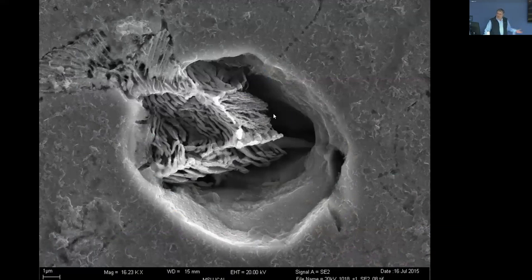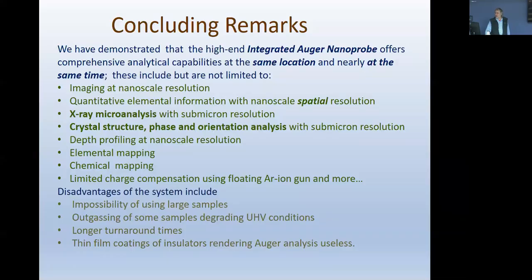The system predicts that these cementite features, these carbides, corrode first, and they open up a hole, and underneath appears to be a manganese sulfide inclusion. If you look carefully, it's a tunnel being dug underneath. So that's what happens. Along the manganese sulfide inclusions or stringers, the system corrodes, and essentially they join together. You have a hole in the hole, on the walls of the carbon steel.